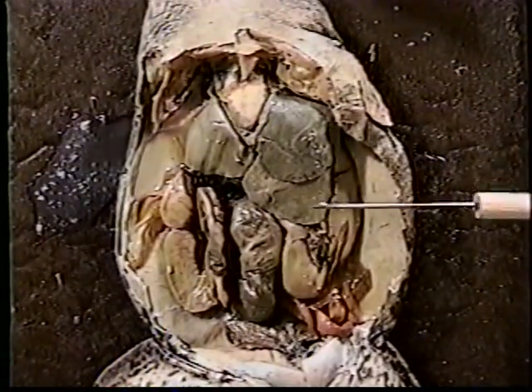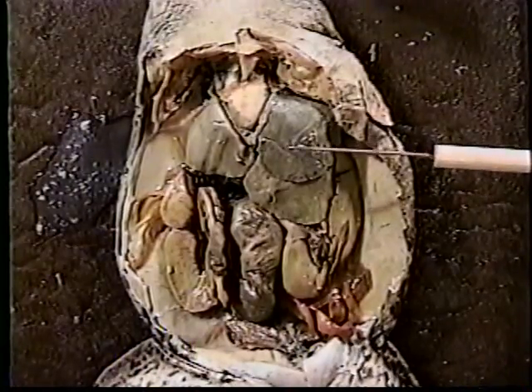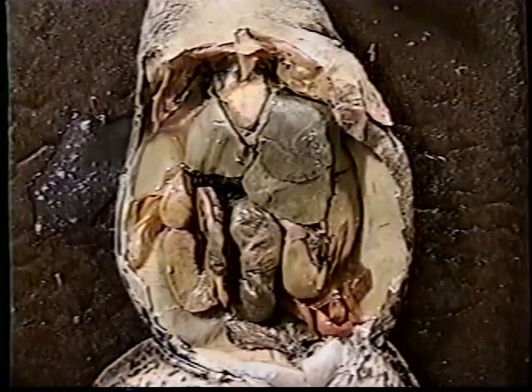The next system that we will examine will be the circulatory system. The circulatory system doesn't have as wide a variety of organs that are part of it. It consists of the many blood vessels that we've seen in many different areas in the frog, and its primary organ is the heart, or the pump for the circulatory system.